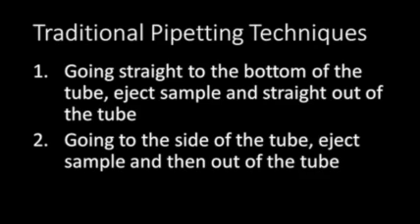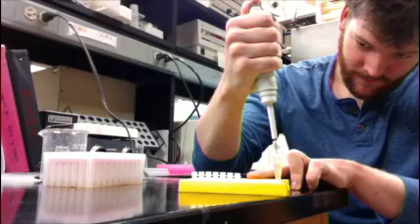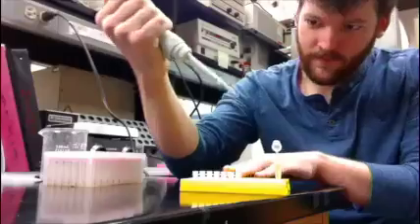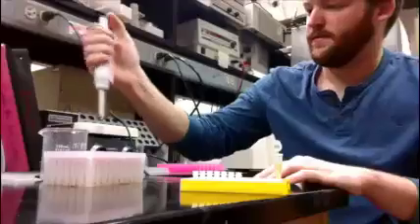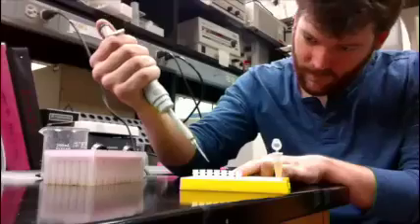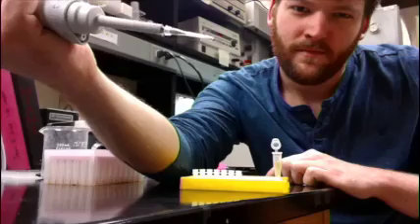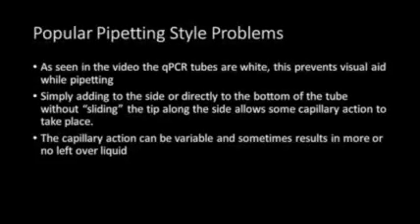Traditional pipetting techniques, you go straight to the bottom of the tube, eject the sample, and then straight out of the tube, which leaves a little bit in the tip. And the other way, you can go to the side of the tube and straight out, also leaves a little in the tip. That was just straight to the bottom of the tube. You can see there's a little bit of liquid left in the tip. And then this one is just straight to the side of the tube, where again you'll have a little bit of liquid left in the tip, which is about 0.2 to 0.5 microliters, which is pretty big variation when you're only dealing with 2 microliters.